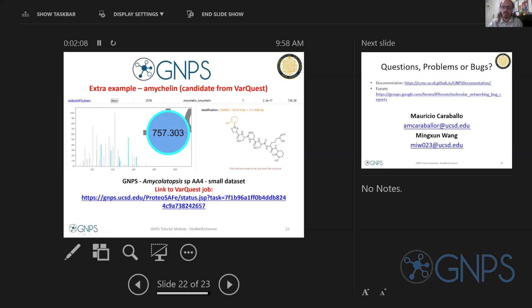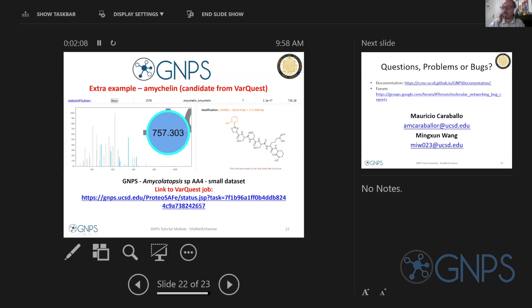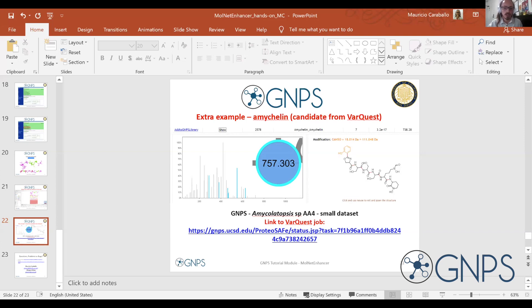This is basically running from the different scenarios — when you have highly covered molecular families versus when you have even one single small molecule that is consistent with the samples you are analyzing. I hope you were able to run and understand the usefulness of MolNet Enhancer in terms of what you input, what you output, and how you can interpret the data.